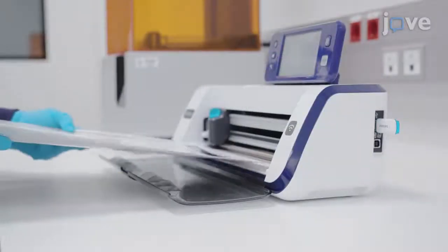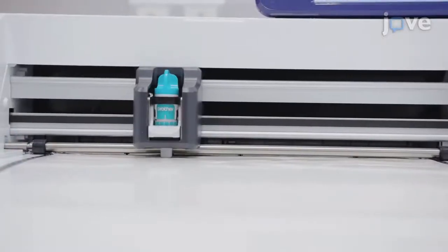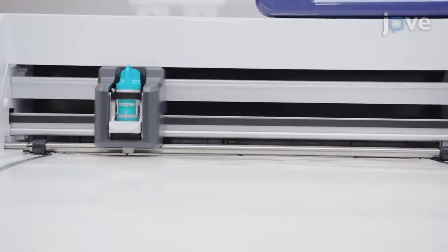When parameters are set, place the adhesive mat with the vinyl into the plotter and start the process of cutting the channel patterns on 95 µm thick vinyl.